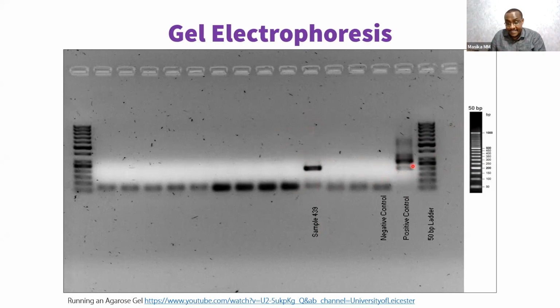But what we did after this was to sequence using something we call Sanger sequencing, that we'll discuss next time, to confirm what this is. Because remember, if you're using group consensus primers, like you want to target any coronavirus, then after you get a positive, how do you know which coronavirus? You go to the next step and sequence this with Sanger to tell you what the sequence belongs to. And so this is a positive sample.